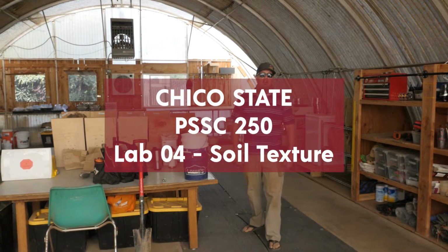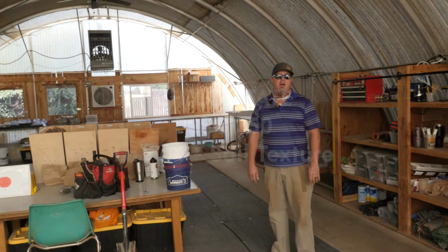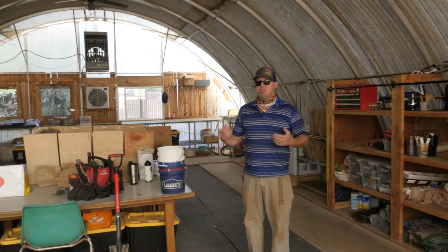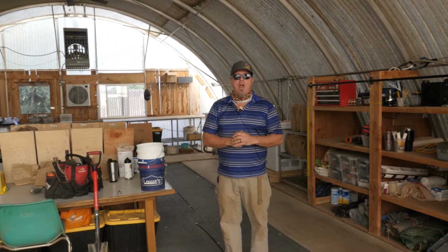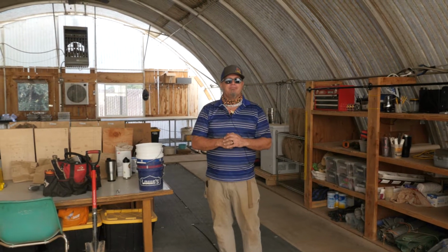All right, here we are in the soil processing area. It's a greenhouse space that we cleaned up a couple years ago to turn into a place that we could do work, handle, process, explore soils in a variety of different ways. This will be the starting point, and then we're going to walk over to the soil pit that's just right over 100 yards away here at the Chico State University farm.